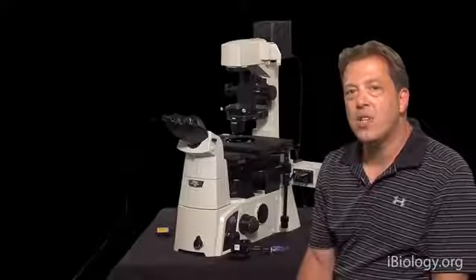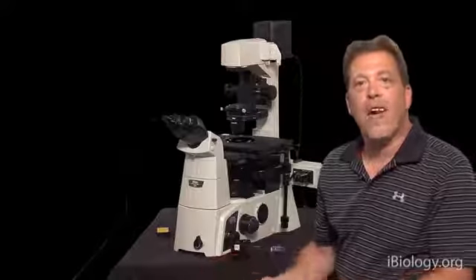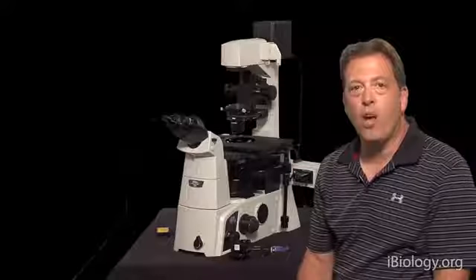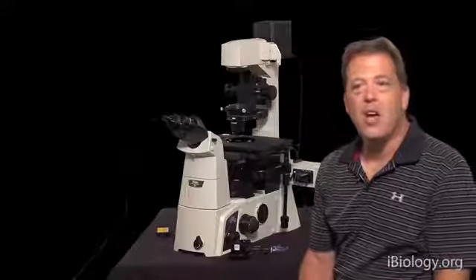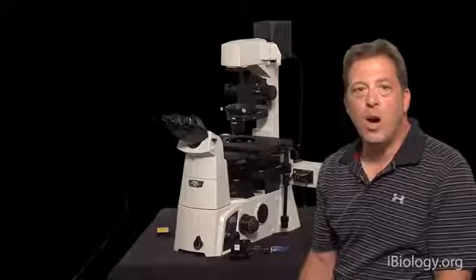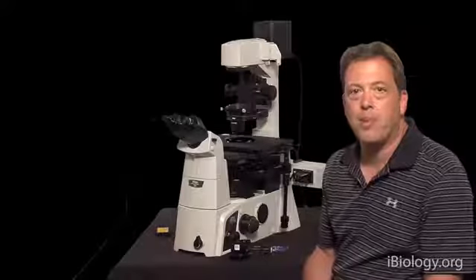And what I'd like to do is give more of a practical view of how you actually get these techniques to work on the microscope, what are the components, and how you would adjust them and troubleshoot them to get the techniques implemented for practical applications.